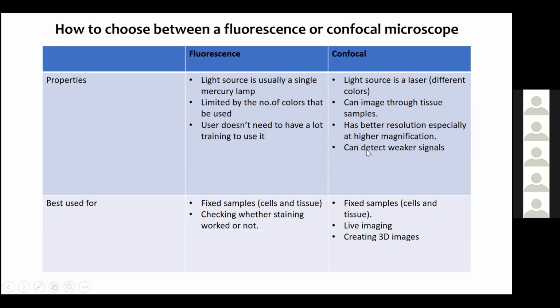So please remember that when you are presenting your data to reviewers, because this does come back as a major red flag to them. If you have a single plane image of a tissue, they will either come back to you saying, okay, we want to see confocal images so that we know whatever data you're reporting is throughout your tissue thickness, and that's the signal that you're seeing.